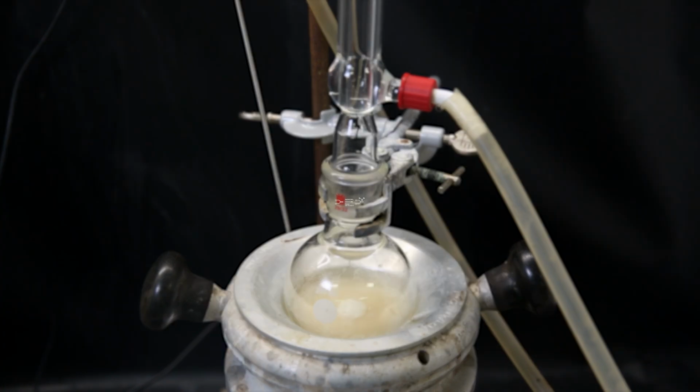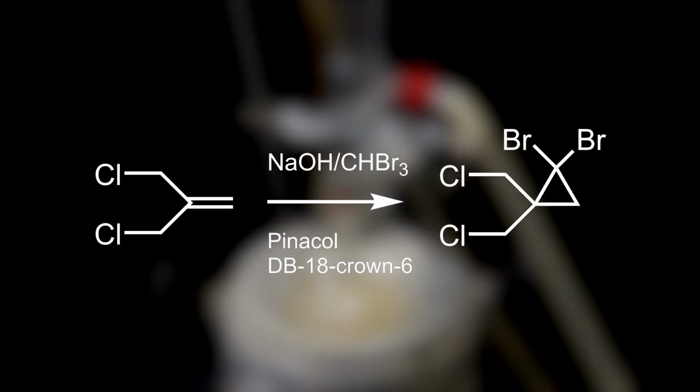for 4 days. In the reaction, the double bond can react with the dibromocarbene to form the dibrominated cyclopropane product. The reaction is improved by addition of pinacol. Pinacol is a co-catalyst that improves the deprotonation in phase transfer catalysis, specifically for dihalocarbenes, while dibenzo-18-crown-6 acts as a phase transfer catalyst and also improves the workup.